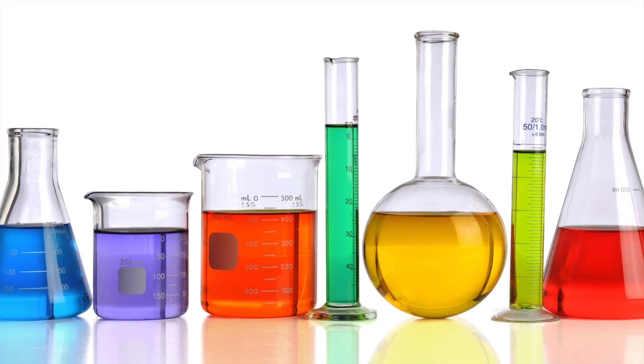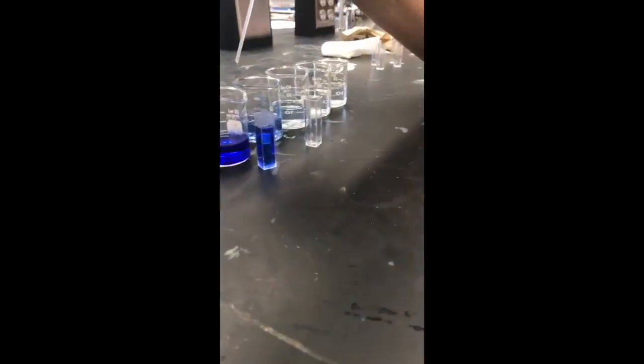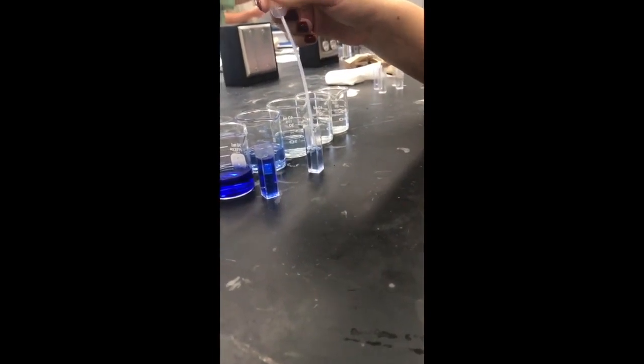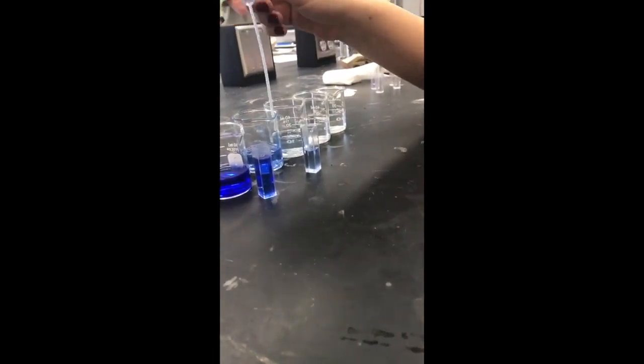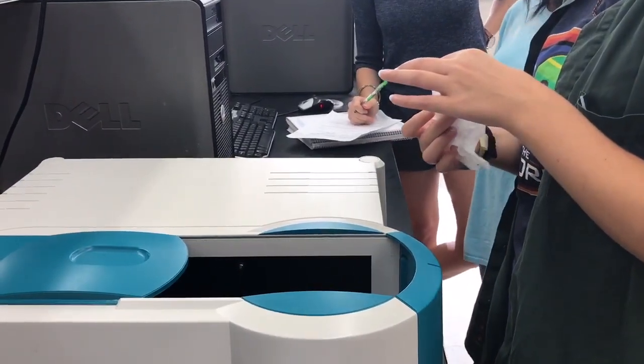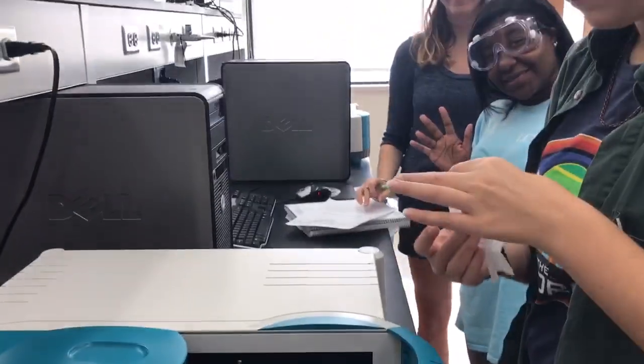Now we're ready to actually start the lab. First, use a pipette to transfer dilution and stock solution to cuvettes. You need at least one stock solution cuvette and one blank cuvette to zero the spectrophotometer with. Once you have your cuvettes, move to the spectrophotometer. There you need to zero the instrument with your blank cuvette.